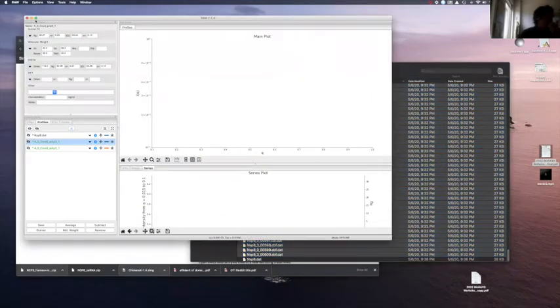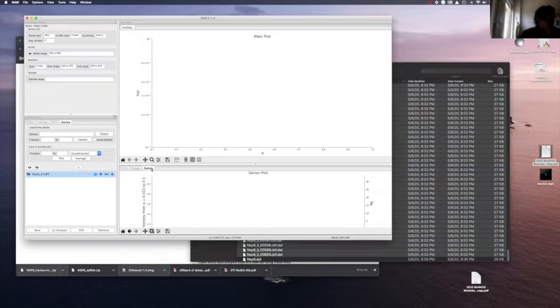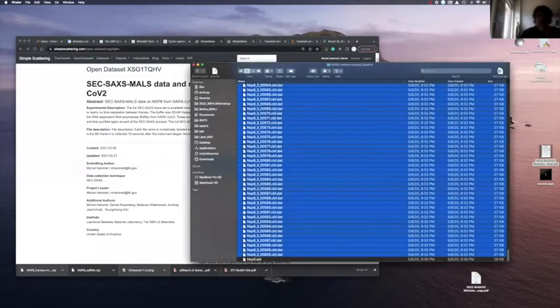And so let's just start RAW. If you start RAW, you can click here on series, and it's right here too. I'm going to start RAW from scratch, so we're going to close it. We can just follow up. So we can start RAW.